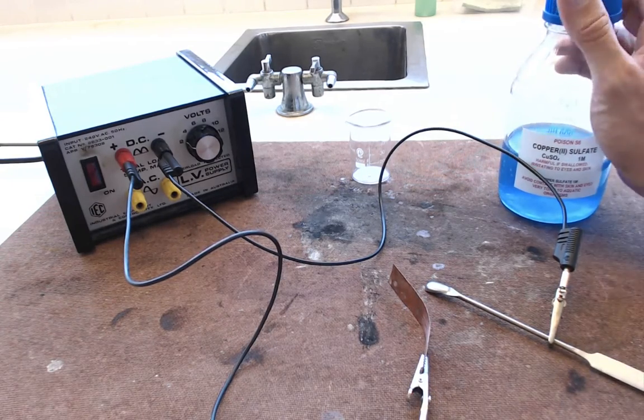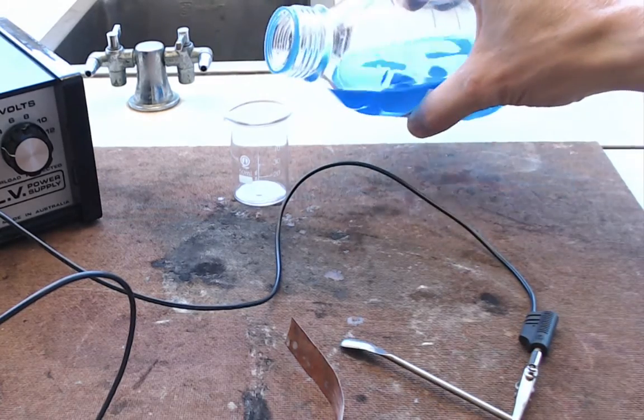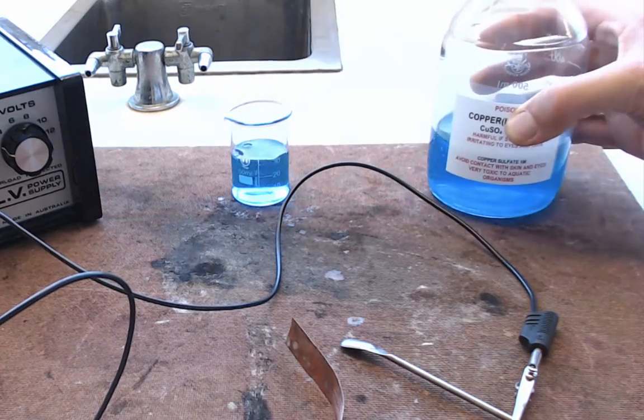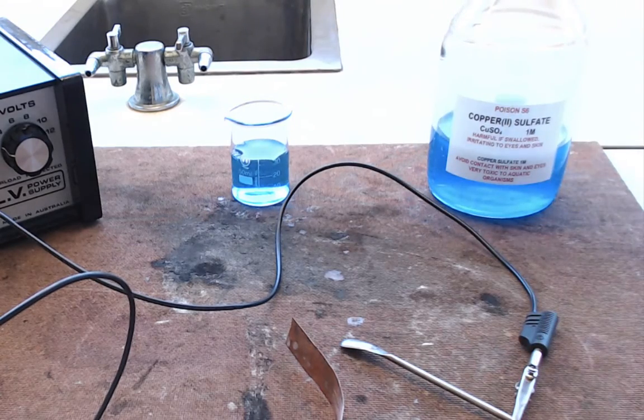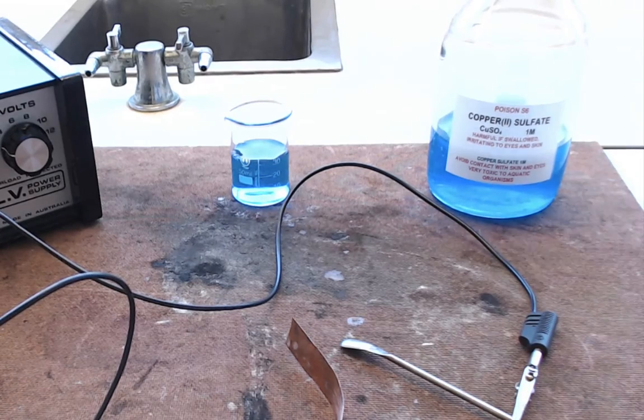Don't need to turn your power pack on yet. You're going to roughly half fill your beaker with copper sulfate. The exact volume is not important, but about half full. Deep enough so that you can submerge your object in it, at least partially.